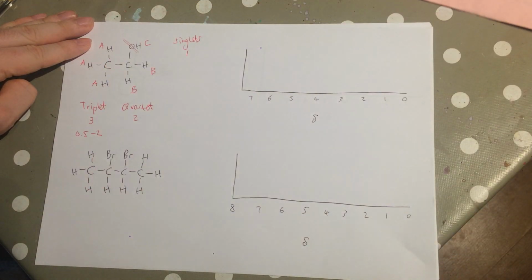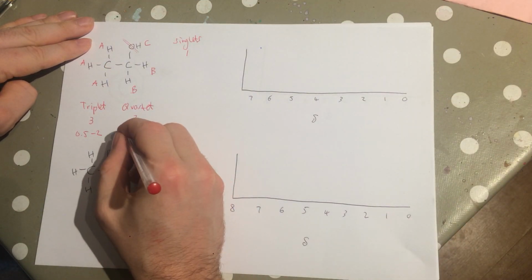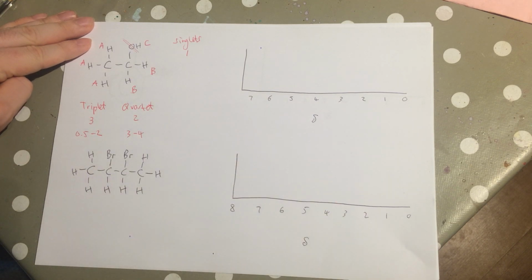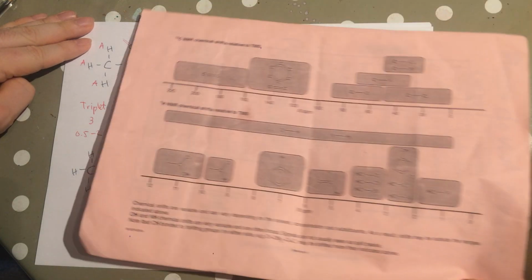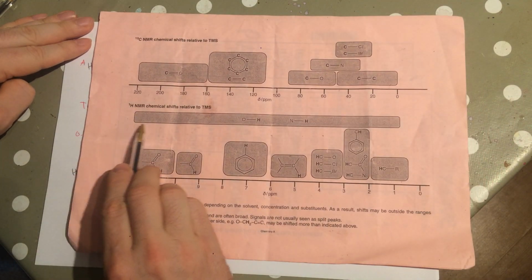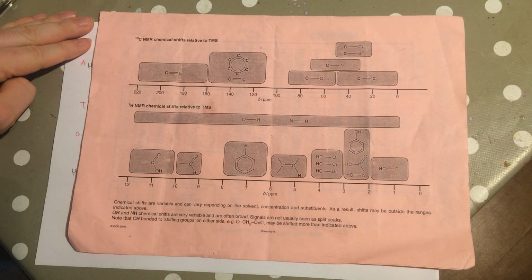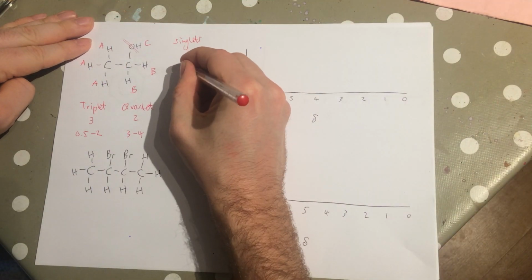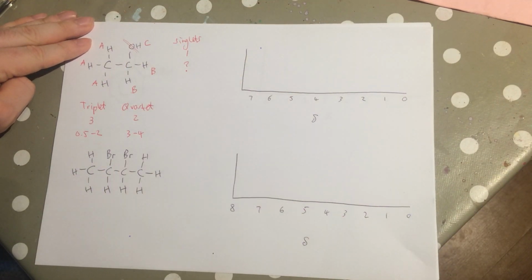So I'm just literally playing snap on my data sheet. What does it look like? So 3 to 4. Now, OH is a tricky one. OHs and NHs, if you look on your data sheet, they're this strip across the top, so they can appear anywhere. So we're just going to put a question mark. It could be anywhere on our graph.